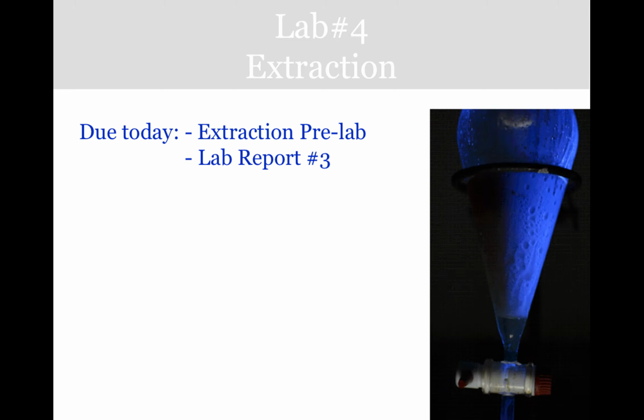When you plan to run an organic experiment, usually the easiest part is running the reaction, and the hardest part is purifying it, then you characterize it to report. So last week in the organic labs, we learned recrystallization as a purification method and some characterization methods like TLC, gas chromatography, infrared spectroscopy, and mass spec.